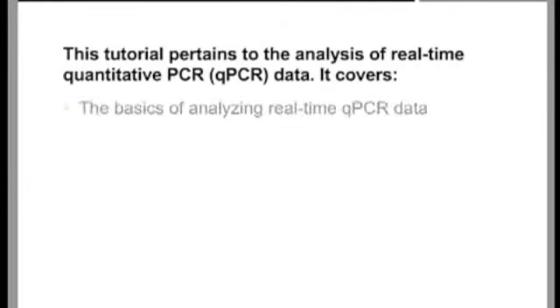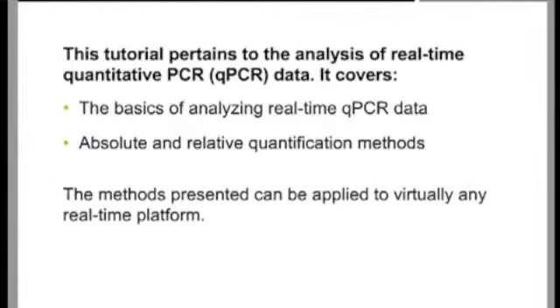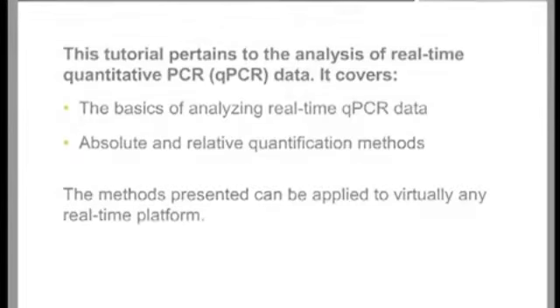This tutorial covers the basics of analyzing real-time quantitative PCR data. It includes information on both absolute and relative quantification methods. Real-time quantitative PCR can be performed on several different platforms, depending on the instrument you are working with. The methods presented here can be applied to virtually any real-time platform, including both the Bio-rad and MJ systems.